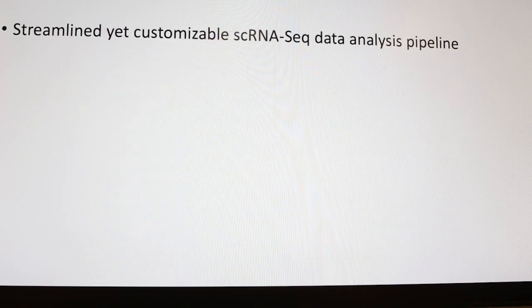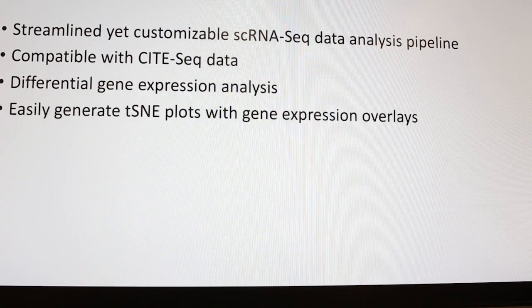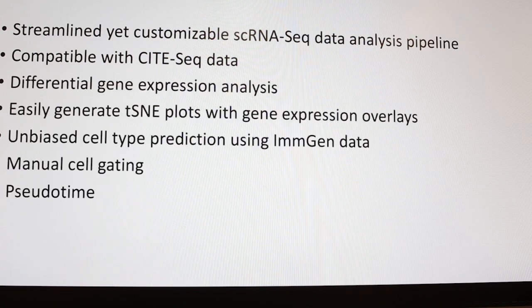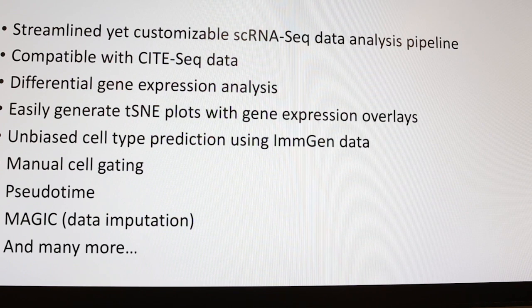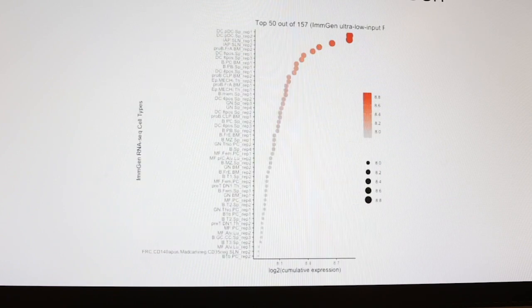This is all stuff we already talked about. Just to reiterate, these are some of the things that have been really useful for me in iCellR, and I've done all my CITE-Seq analysis in this package. And I think the real power of iCellR is for VDJ. It does a thorough analysis for single cell VDJ analysis. Probably. I don't have anything about VDJ analysis yet.